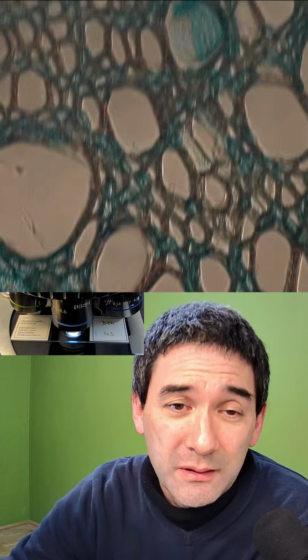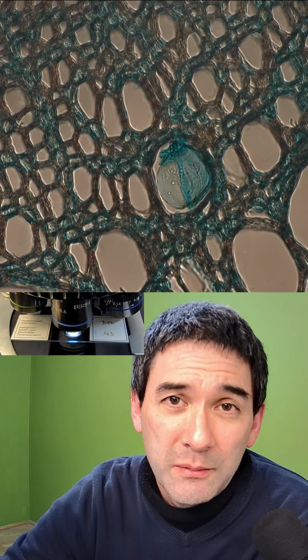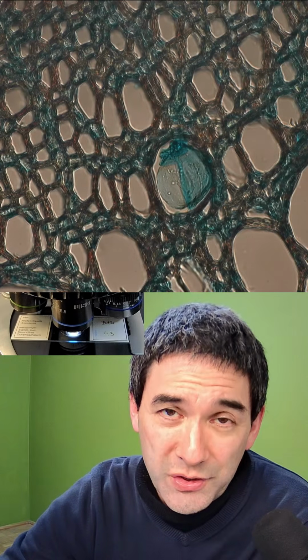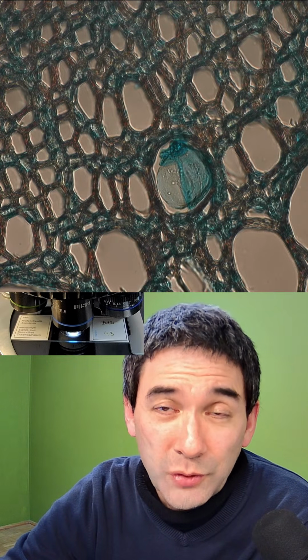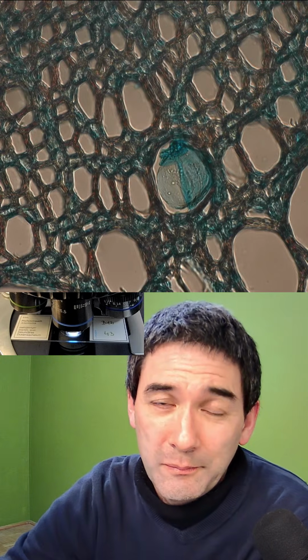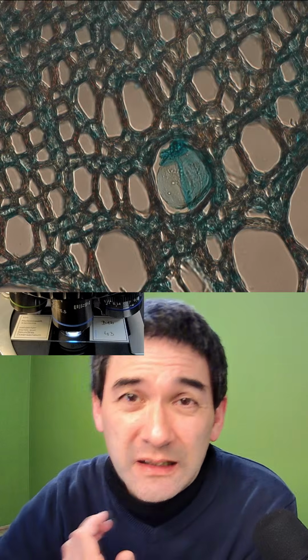I tell you what can happen, and I've mentioned this already several times before, is when people are not careful with their oil immersion procedure. This can be actually a problem, because sometimes it can happen that people rotate their non-oil immersion objective into immersion oil, like the 40 times objective. You shouldn't do that. Then you have to clean it, right?